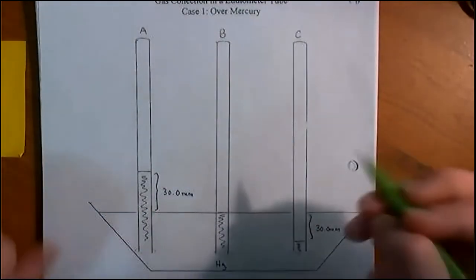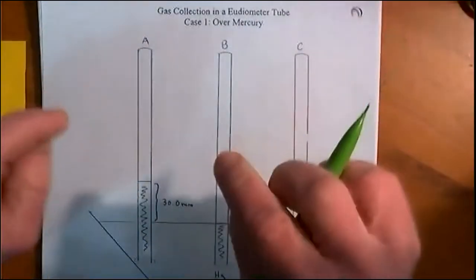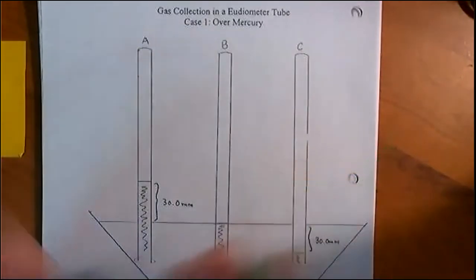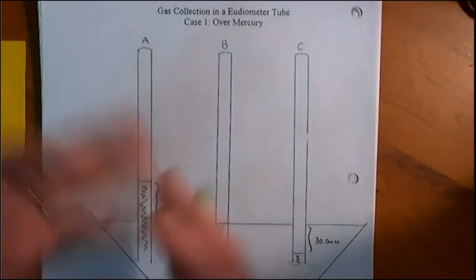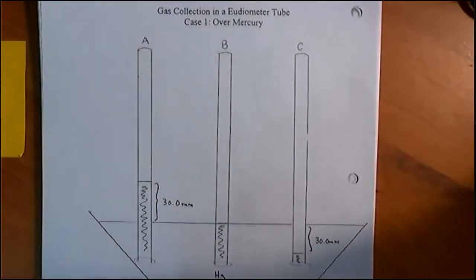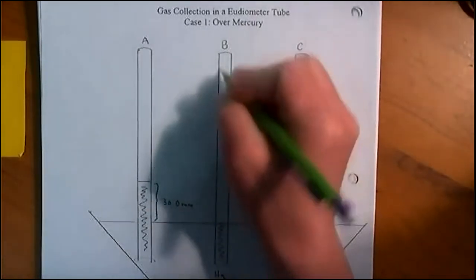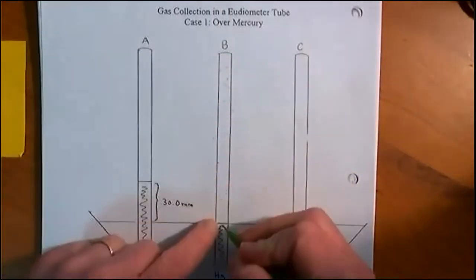All right, a eudiometer allows us to indirectly measure the pressure. Indirectly. Well, how? Well, whatever gas we've collected, we know that gas is colliding with itself and the walls of the eudiometer.